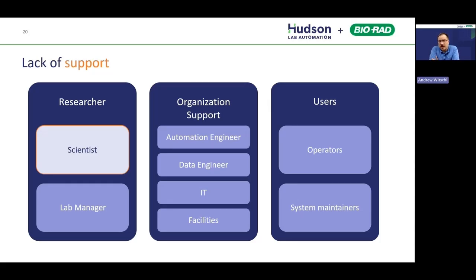This is one that never really comes out on the front end of automation, but ultimately, if you look at the success of automation 6 months, a year, 2 years down the road, usually the reason that these systems do not get the value or the ROI that our users are looking for is because of a lack of awareness of what it takes to support automation in your lab. So what we have here are a bunch of different roles, and this is from an idealistic, let's say, comprehensive automation.